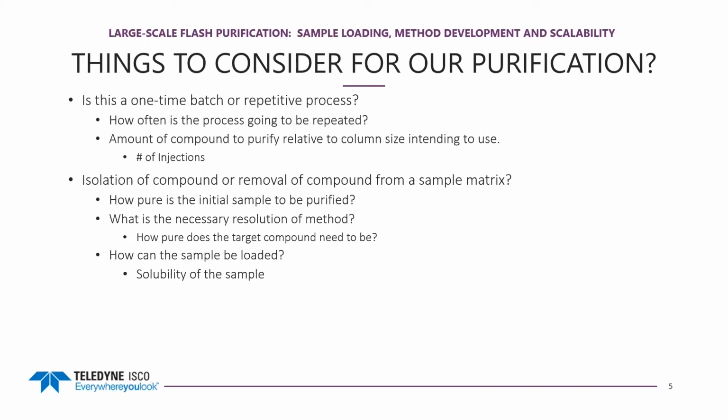How pure the initial sample is, is another question you need to ask yourself. If it's relatively pure, then you're usually able to load more of that sample. And then, how close are the impurities to your compound? What's your necessary resolution? How pure does your target compound need to be? There are some labs that we work with that have very strict purity standards, up to 99.9+% for some of their compounds, while other applications may not need that level of purity.